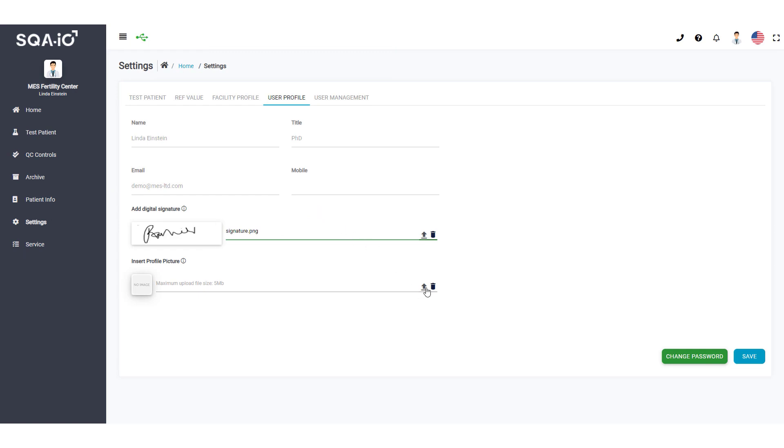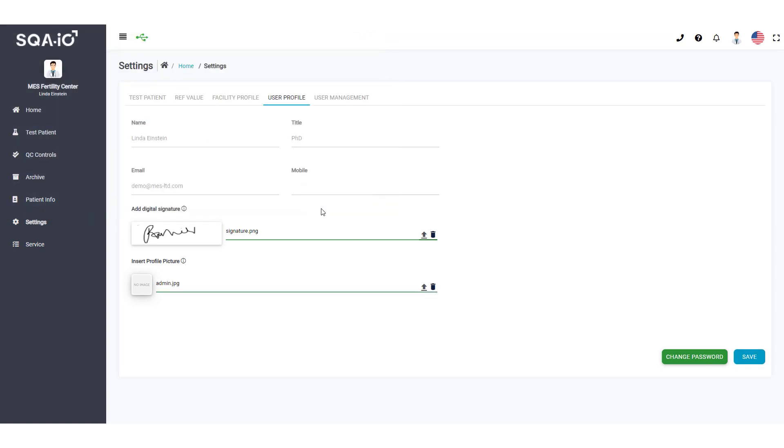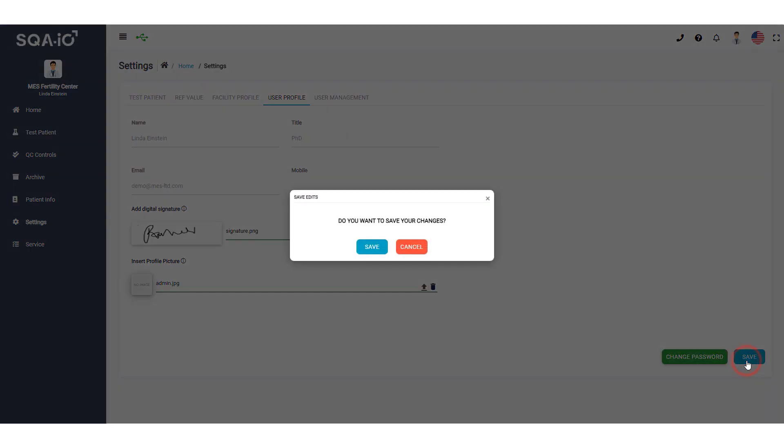Here is where you can add your profile picture. It will only be shown when you are logged into the SQA-IO interface. Make sure to save your changes.